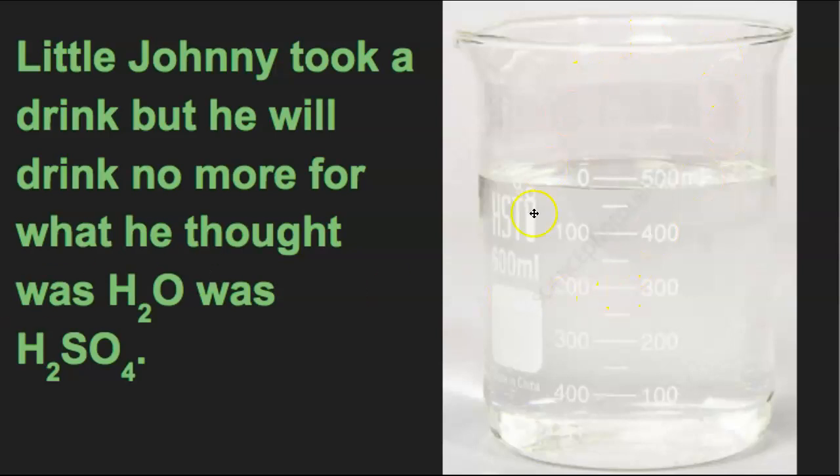Now, when you look at this beaker, you can make some observations. It's a clear beaker. It looks like it has a clear liquid in it. There's a little less than 500 milliliters of liquid in it. We don't know the temperature. We don't know the chemical composition of the liquid. The problem is, this could be water to quench your thirst, or it could be H2SO4, which is the chemical formula for sulfuric acid. That would do you great bodily harm and potentially kill you, depending on how strong it was. It would definitely change your life.